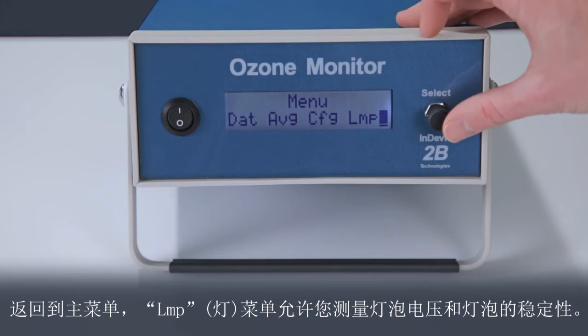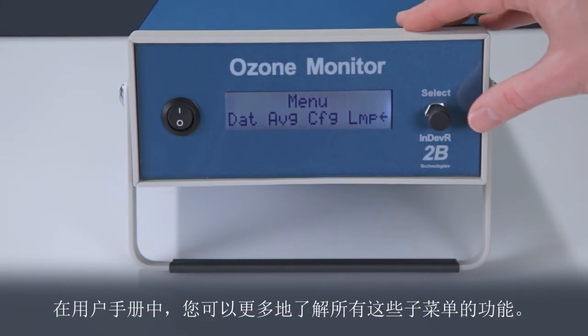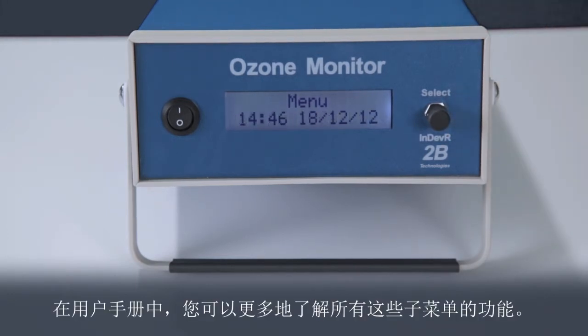The lamp menu allows you to measure the lamp voltage and stability of the lamp. To return to making measurements, select the left arrow. You can learn more about the functions of all of these submenus in the user manual.